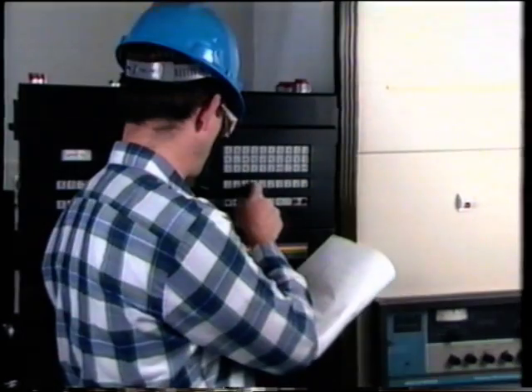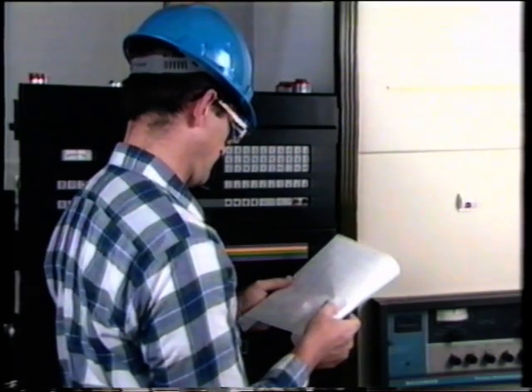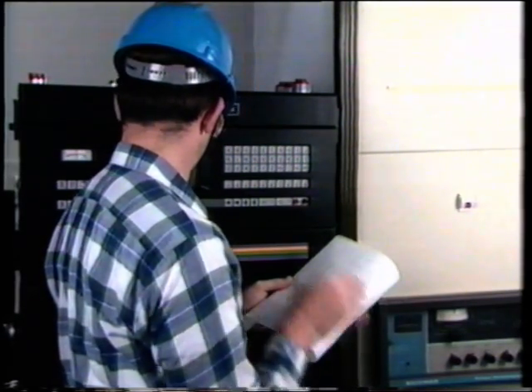Retention time is the interval between sample injection and the point of maximum detector response. In this example, the retention time is 5 minutes. Components that interact strongly with the column packing elute slower and have longer retention times. By looking at a chromatogram, technicians can determine column efficiency for specific applications.